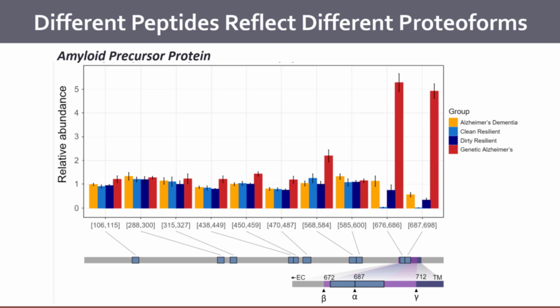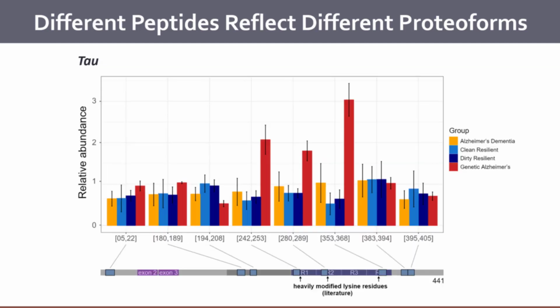Now, this has been known for almost 30 years as being a reasonable biomarker and diagnostic for Alzheimer's disease. And some of these changes are actually 40-fold, right? So these are actually pretty significant changes in the mass spectrometer, and yet they'd still be ignored in many cases. Here's the other main biomarker, so tau.